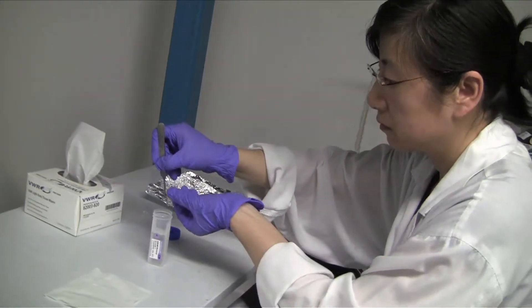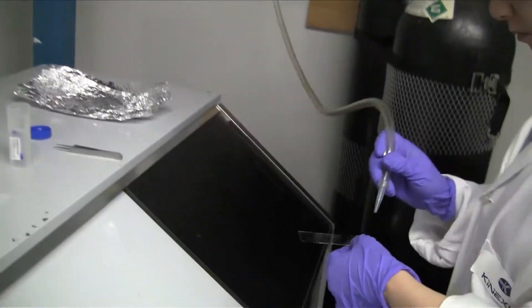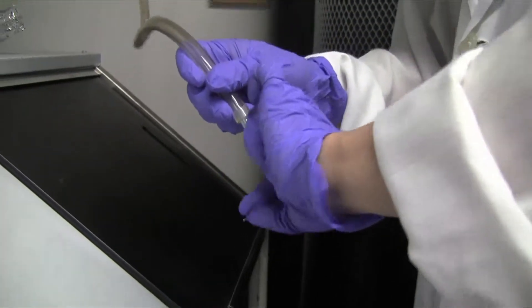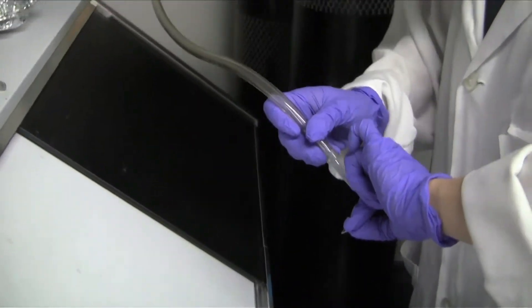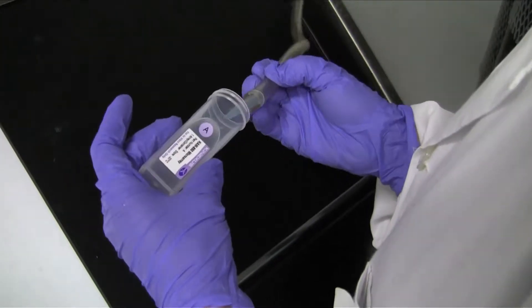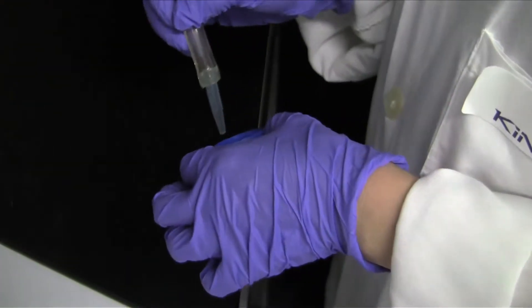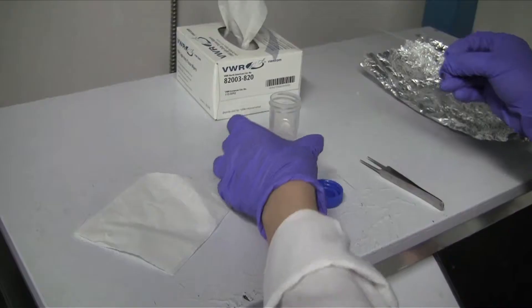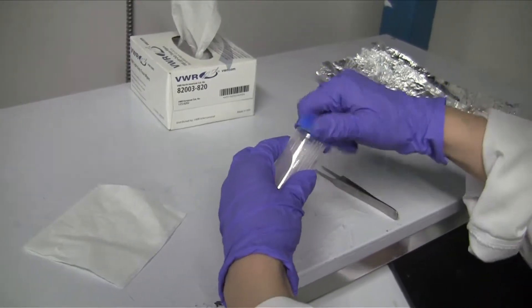Dry the microarray with nitrogen flow. At this point the microarray is ready for scanning. If you are interested in having Conexus perform the scanning or analysis for you, dry the microarray slide container with nitrogen flow, store the microarray inside the container, and keep in the dark at 4 degrees.